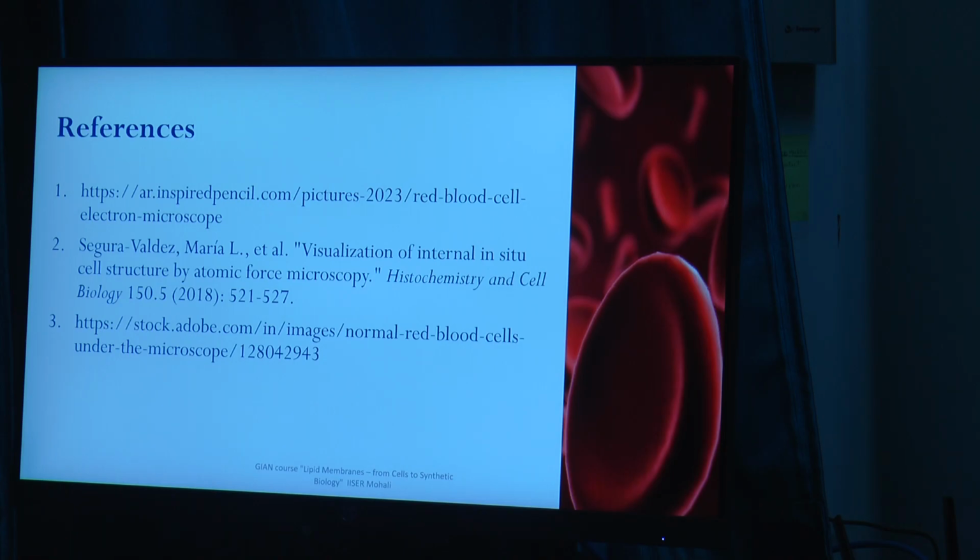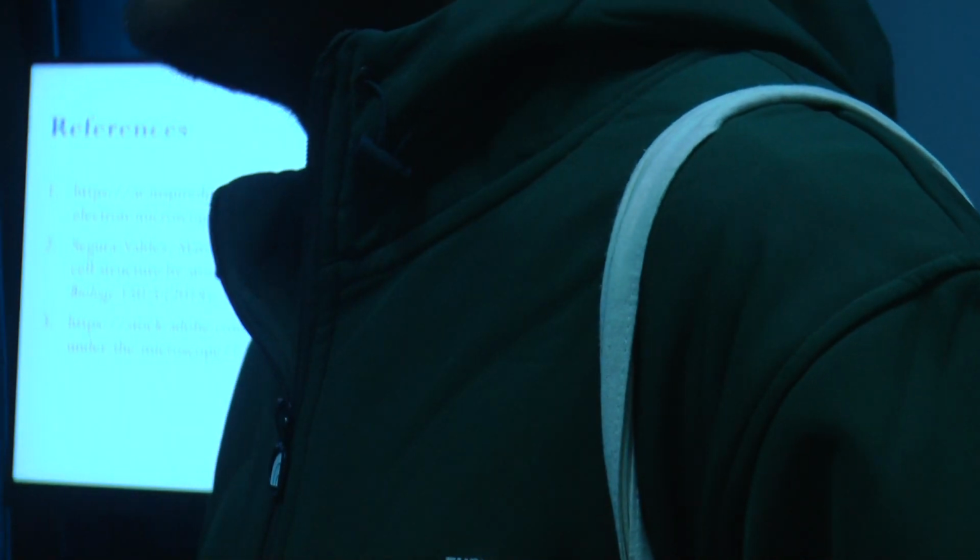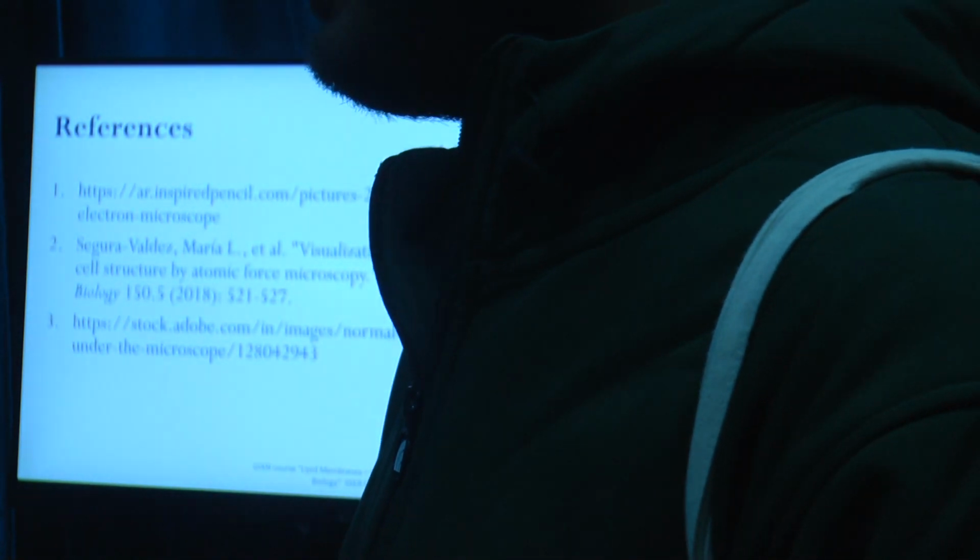So kindly segregate all the ones in one place, twos in another. First, all of you fill the saline in your micropipette tubes, write your name, and then all of you can come in turns and take the whole blood and add it in there.